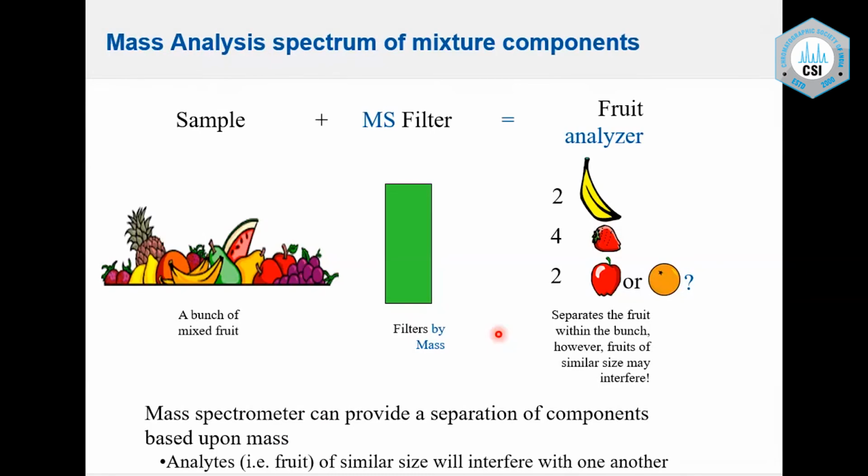Now the ion beam entering the optics has the positively charged ions which are required for analysis. With that, some of the elements may not get ionized, or may react with a different analyte and form some polyatomic interferences.